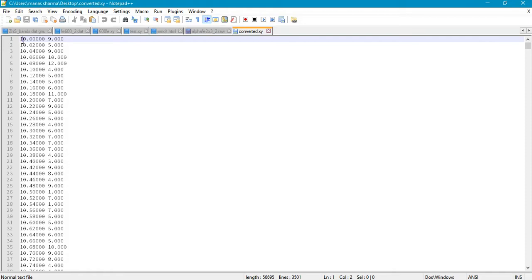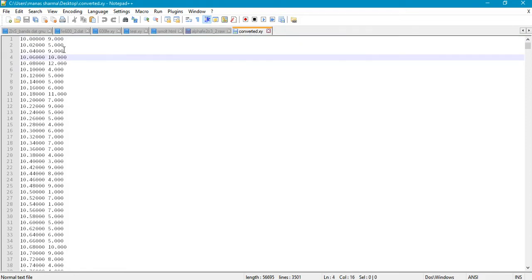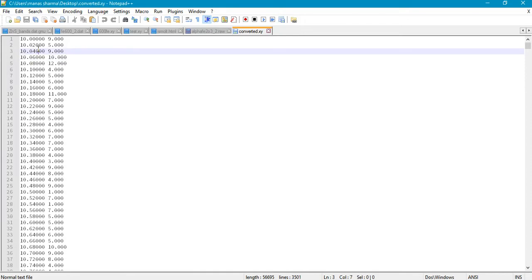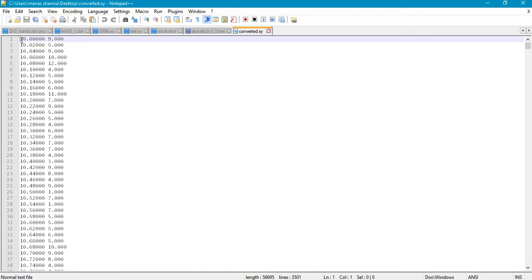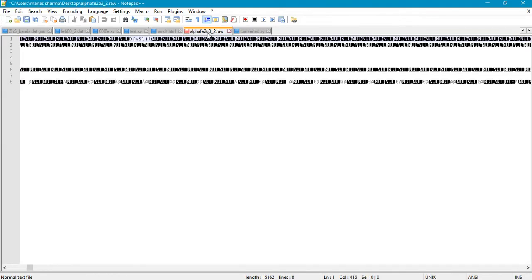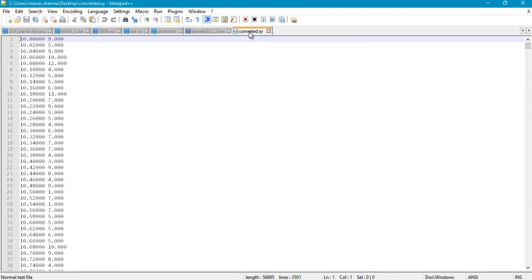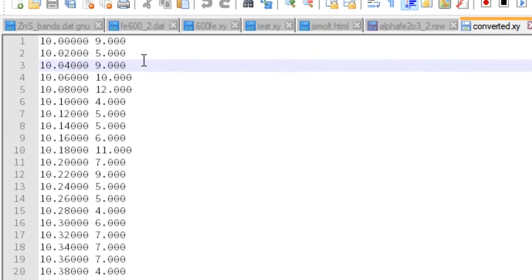In the last tutorial, I showed you how to convert the raw data file generated using any popular X-ray diffractometer into a readable format. We came up with a file called converted.xy, which contained the X and Y axis values for the XRD pattern. This was converted using powdll, and in case you only have the raw file, you can refer to that previous tutorial. However, if you already have these X and Y axis data values, then you can continue with this tutorial.